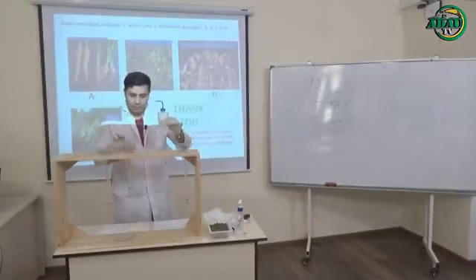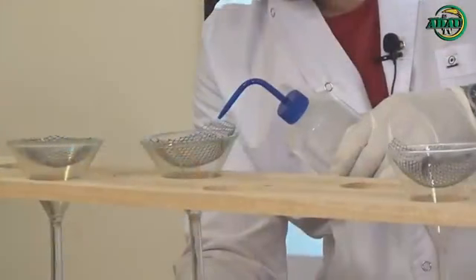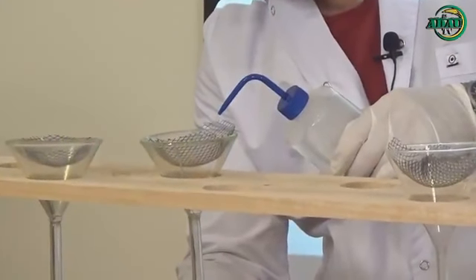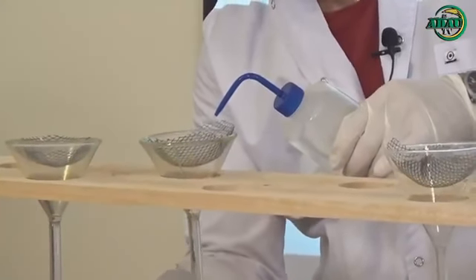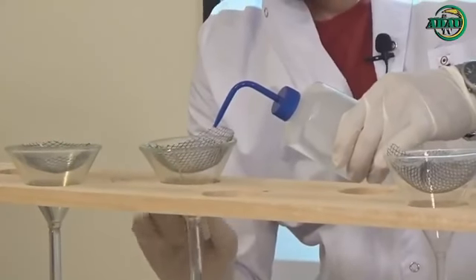Then put your water inside the glass or funnel. At this point, you must be careful. Why? Because try to do it without bubbles.